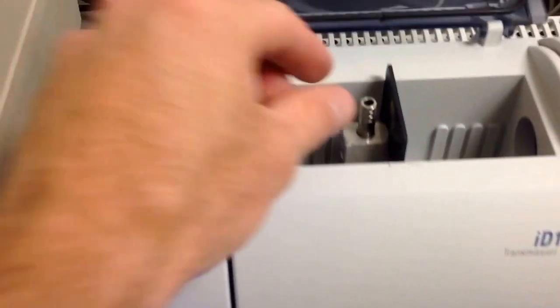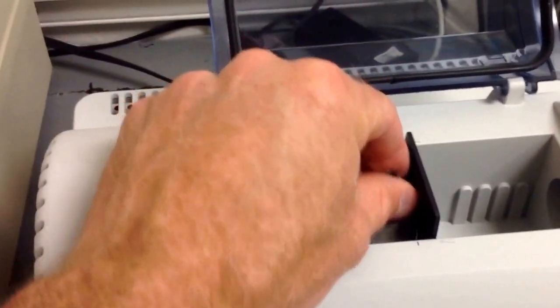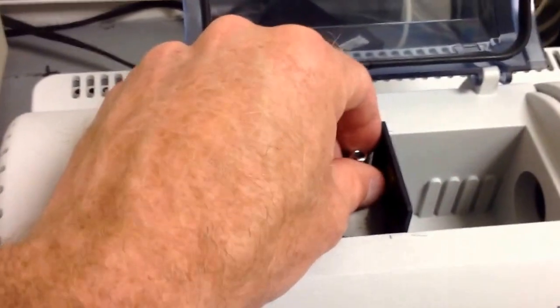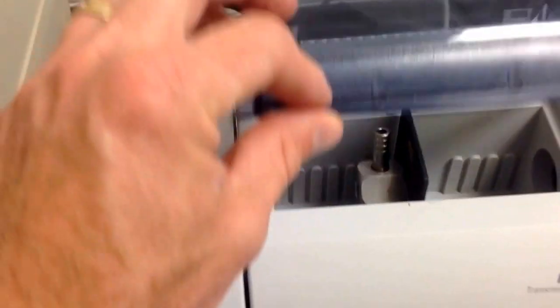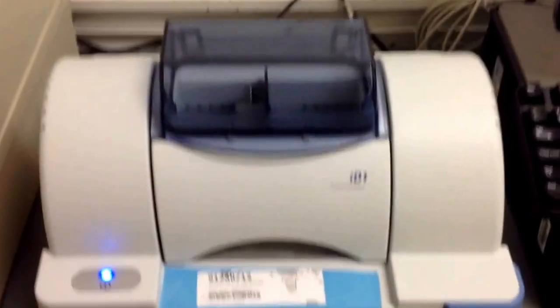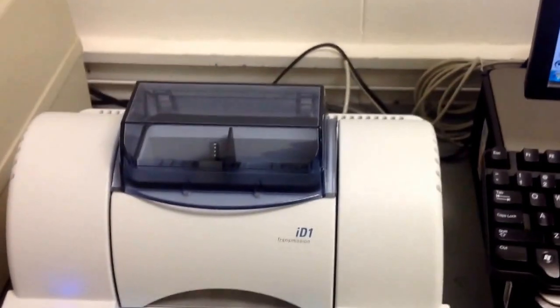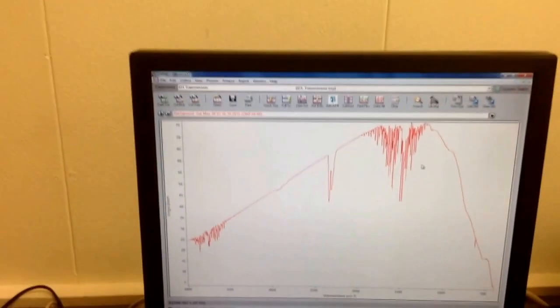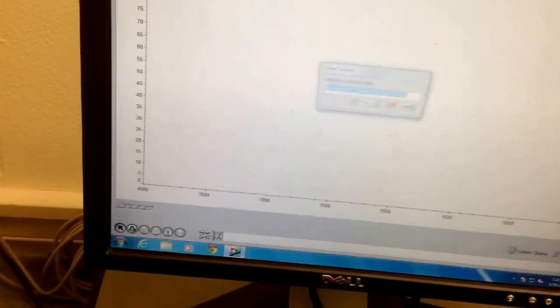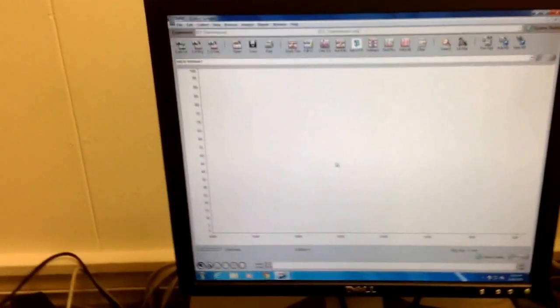Now you can see that this just sits in the sample holder inside the device again. I'm going to put the lid down. Obviously, I'd like to have inert gas, but I've got a background shown here again. I'm going to go ahead and collect a sample. Again, I'm not going to worry about the name right now, although I am going to save this in a moment.